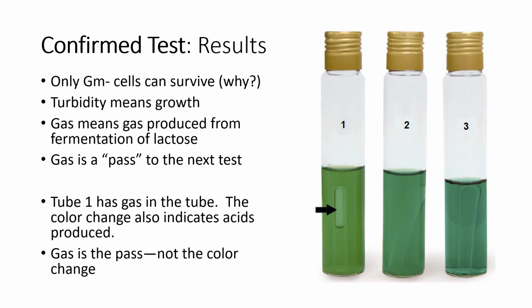So the person whose well water came up positive in the presumptive test in the lactose broth, very concerned, says, oh my gosh, there's feces in my water. And I would say, hey, you don't know yet. At the end of this confirmed test, they would go home happy knowing that whatever is giving them gas in the lactose broth was a gram-positive, which means this is not fecal. It's not E. coli. And so what you would know is you have bacteria in your water, and you probably do. Bacteria are everywhere. So unless you literally sterilized your water, yeah, you got bacteria in there. That's just the way it goes.